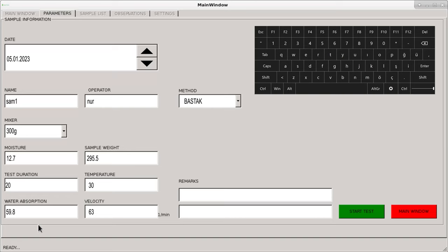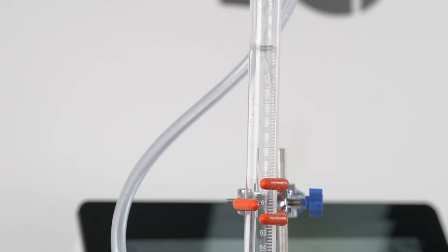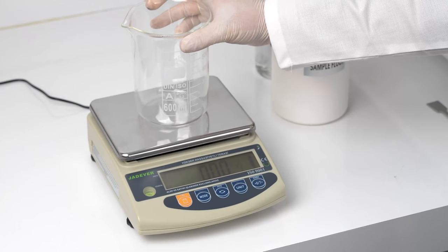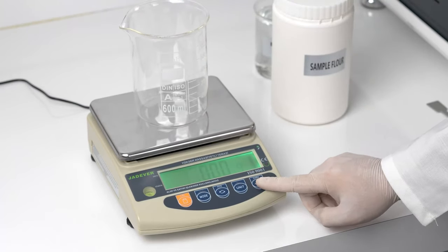The working speed of the kneading blades, test temperature, and additional information can be monitored on the device touch screen. Pure water at standard temperature is transferred to the glass burette on the device, and the excess pure water is automatically discharged. The amount of flour sample is weighed with a precision of 0.01 gram after a clean container is tared on a precision balance.